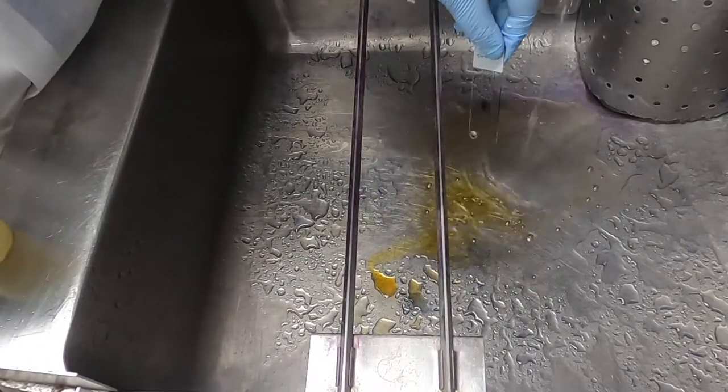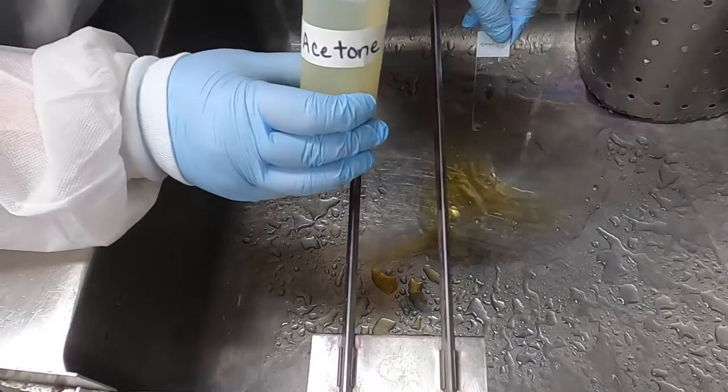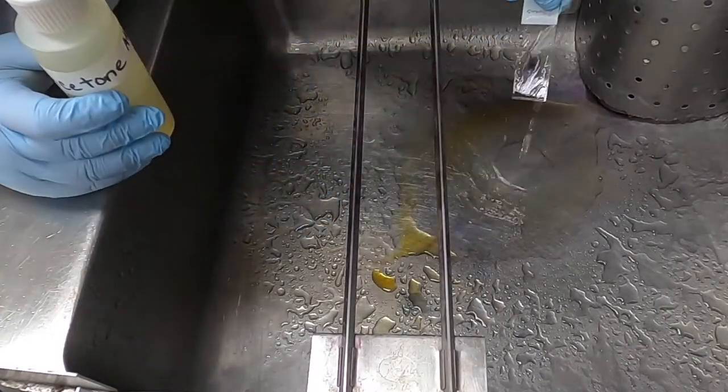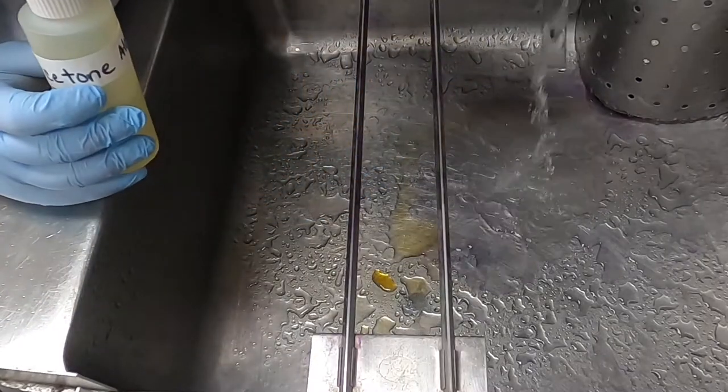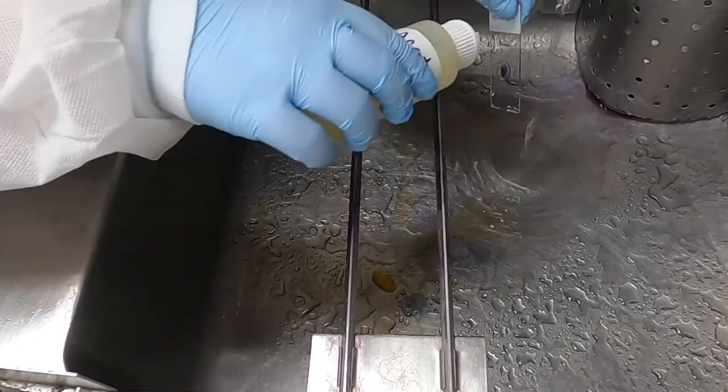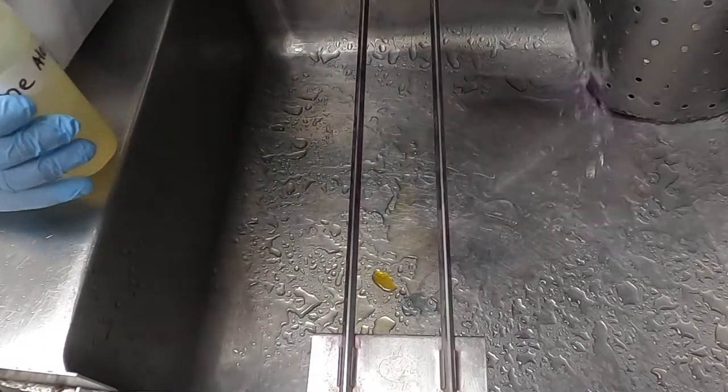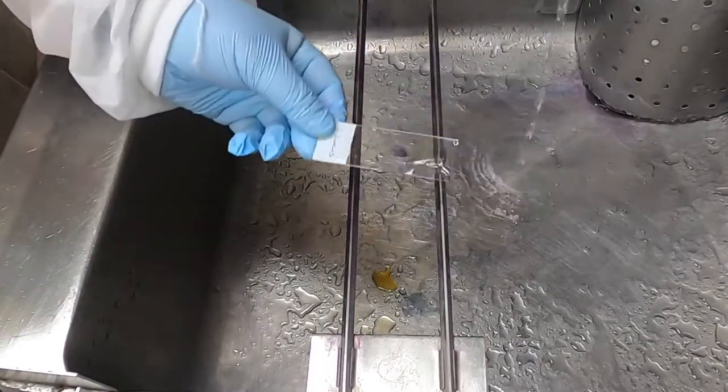Now the next step is decolorization and this is a really critical time in the Gram stain. What you want to do is flood the slide with acetone and rinse off quickly. You want to do this until the water runs clear but you have to be careful not to over decolorize your cell or Gram positive organisms can look Gram negative.